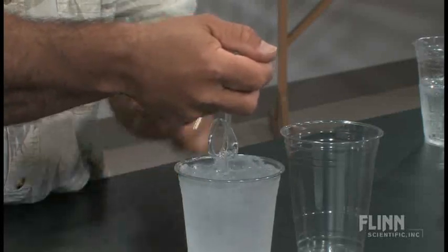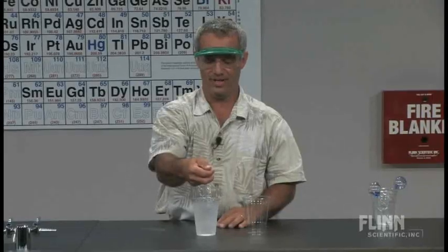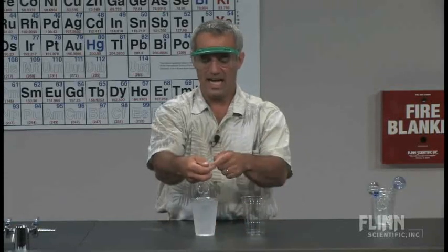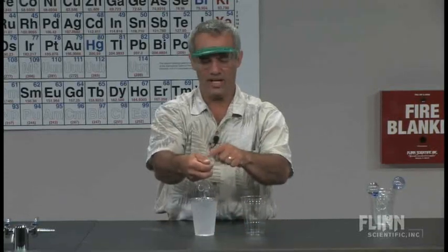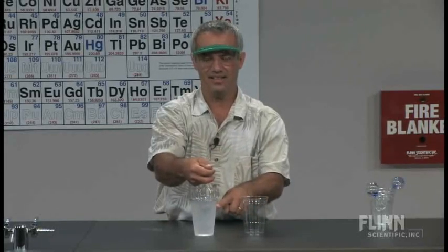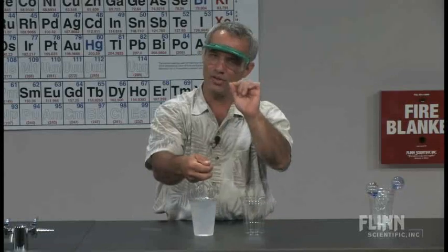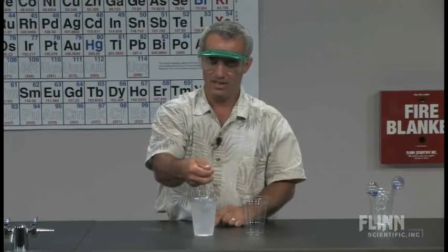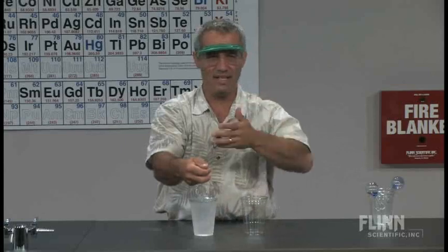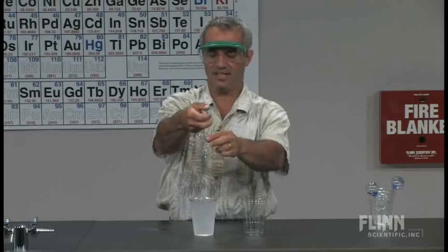Almost instantly, up here where I'm feeling it, gets cold — almost too cold to hold on to. What's going on? Well, I'm essentially doing a little distillation right here. Here's my condensing tube in the cold ice water, and here's my heating chamber. I'm not boiling it, but you don't have to boil something to distill it — that's important to point out. Distillation can take place any time you have vapor coming off and you can get it to condense somewhere else. So I'm causing evaporation here and condensation down here.